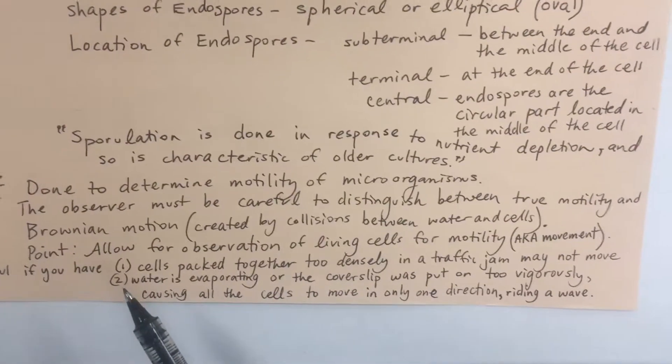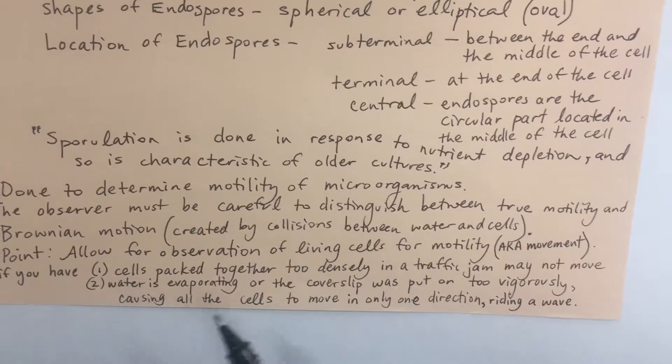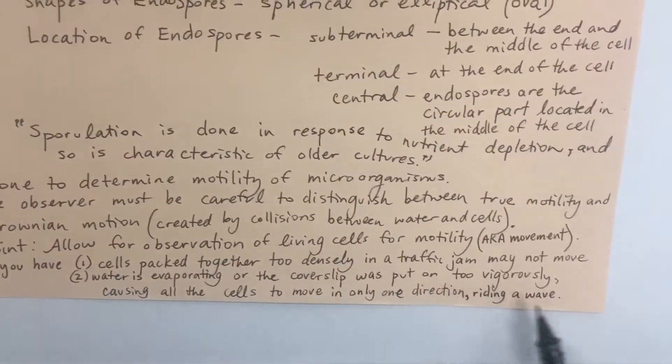Next, please be careful if the water is evaporating or if the cover slip was put on too vigorously. Both of these instances can cause the cells to move in only one direction, kind of like your microorganisms are riding a wave like a surfer.